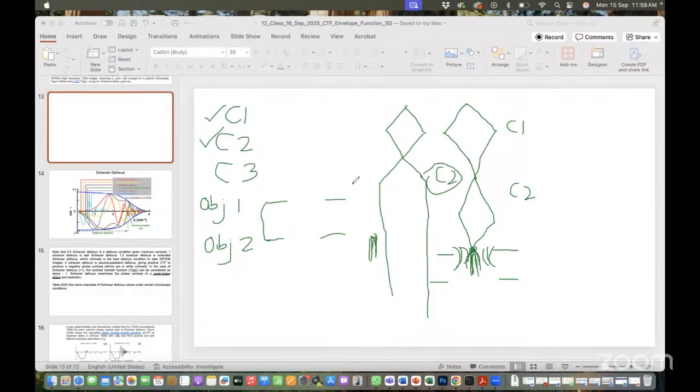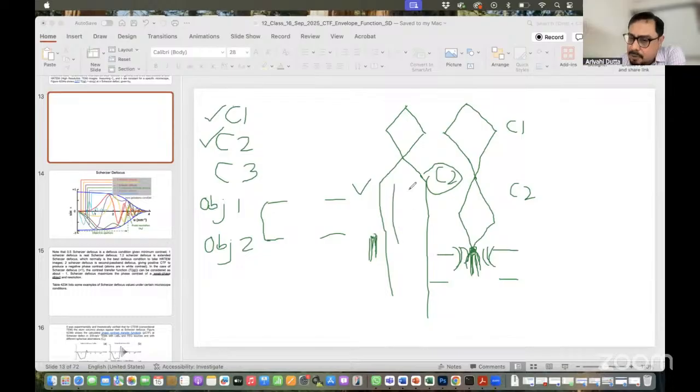Okay. One is using the C2 lens under focused. So when the C2 lens is under focus, this is a parallel beam. Otherwise, with the C2 lens, you will make a focus just above the sample, and then with your upper objective lens current, you will make it in such a way that from that spot, all the electrons will come out straight like that. Then it will make your beam parallel.